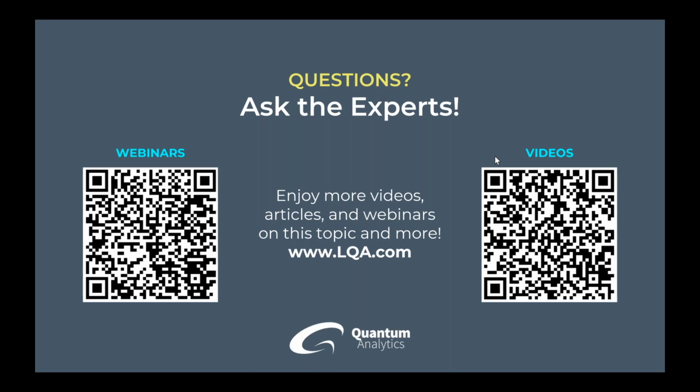Great. And if I have an unknown sample and want to identify the polymer, should I start with the flash pyrolysis mode of operation? You could. However, if it's completely unknown, you have to guess the optimal temperature for your pyrolysis. And that goes to the challenge that if you just do it by guessing, you could do over pyrolysis, which means you are heating your sample more than you should.